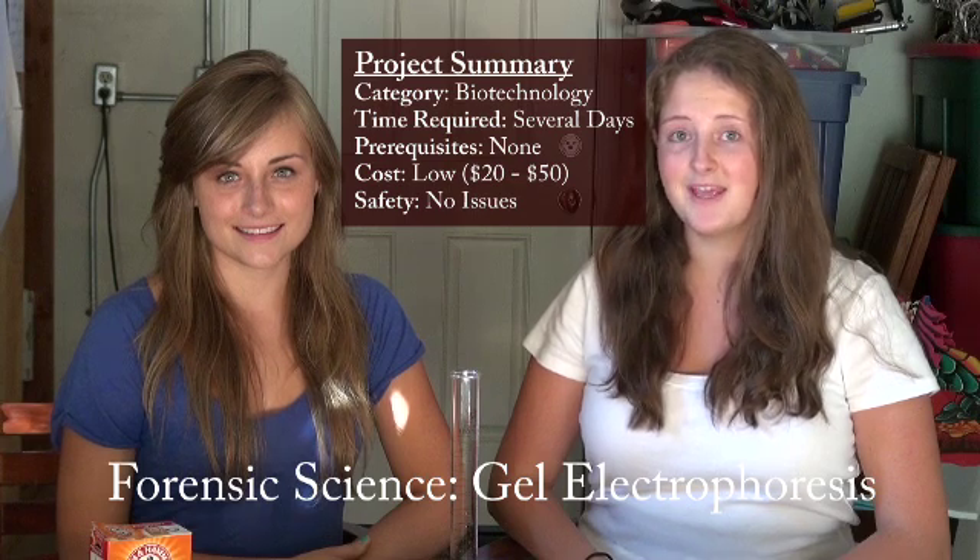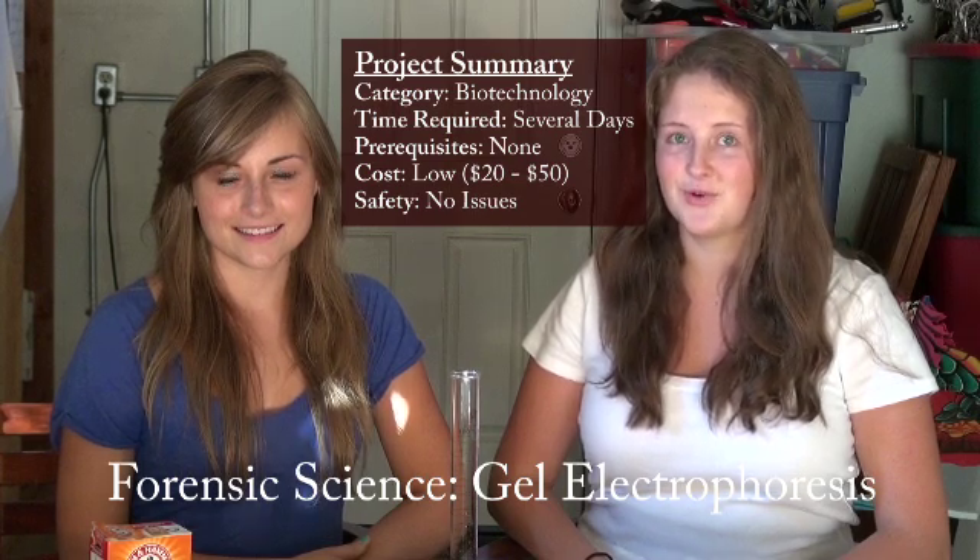Today we'll show you how to make and use your own gel electrophoresis apparatus. Here's all you need.